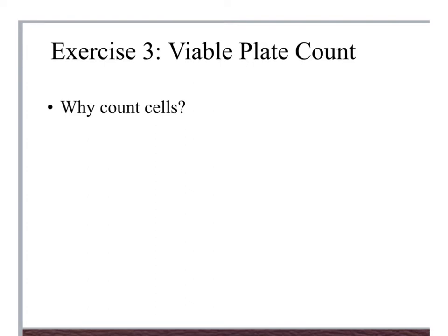And we also have to go through how to do some calculations. So I've got this split into 2 different videos. So why would we want to count cells? Well, let me give you a few examples.